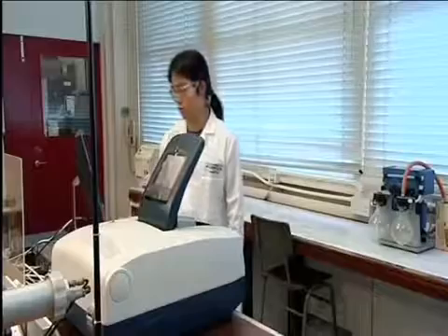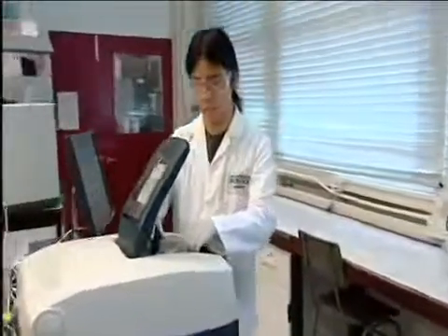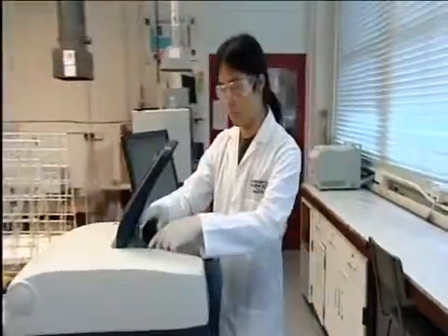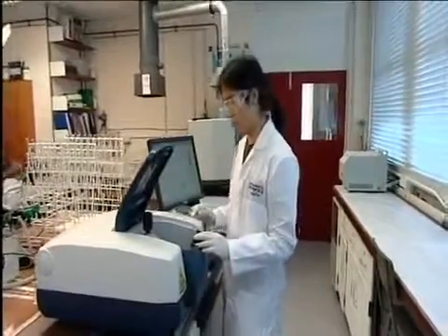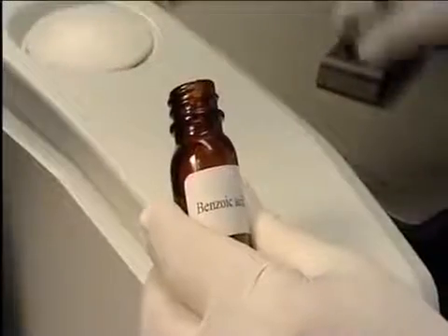Here, we will run the IR spectrum of solid benzoic acid. The instrument is switched on and a blank is run with no sample in place. This is to find the absorption of the air, which must be subtracted from that of the sample.